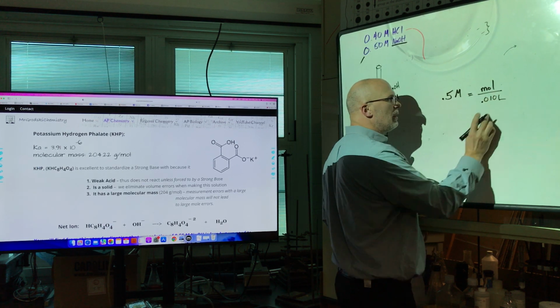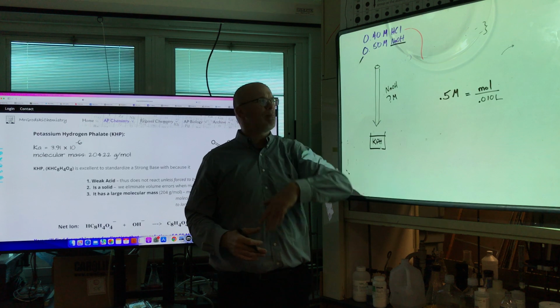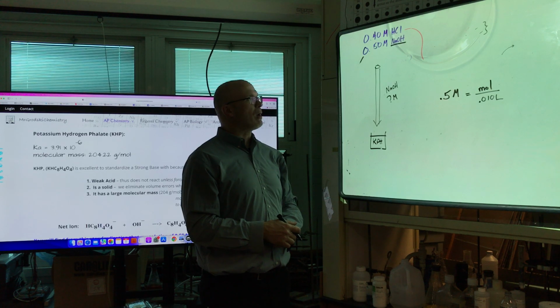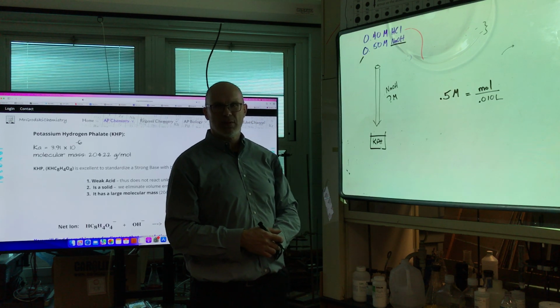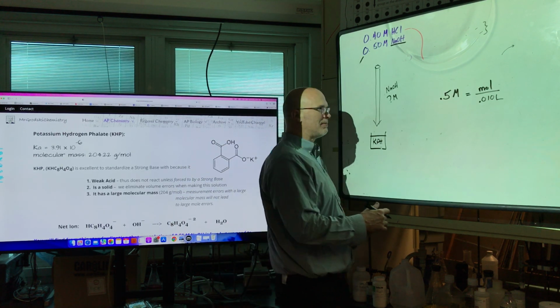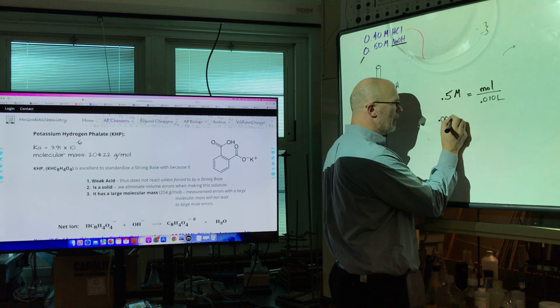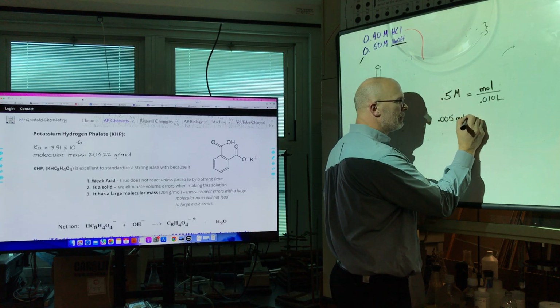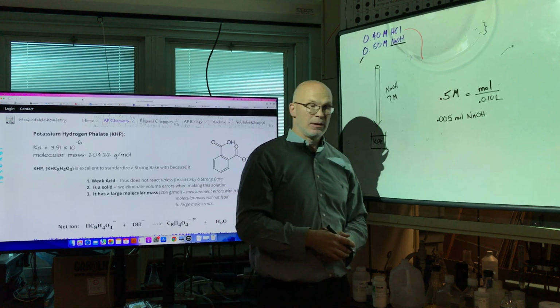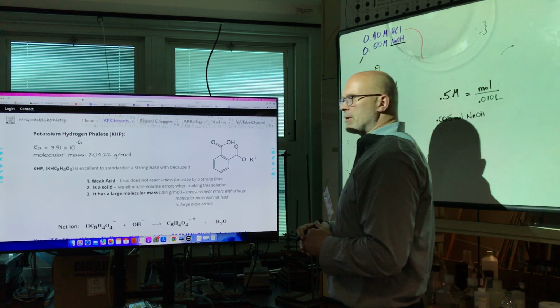Let's go find how many moles that will deliver if I drop 10 milliliters. What's 0.01 times 0.5? 0.005. How many moles do I got? It's 0.005. Okay, good. This is moles of what? NaOH I'm going to deliver, correct? I'm designing my titration. The target is 10. Might be a little more, a little less. You can guess on that one.